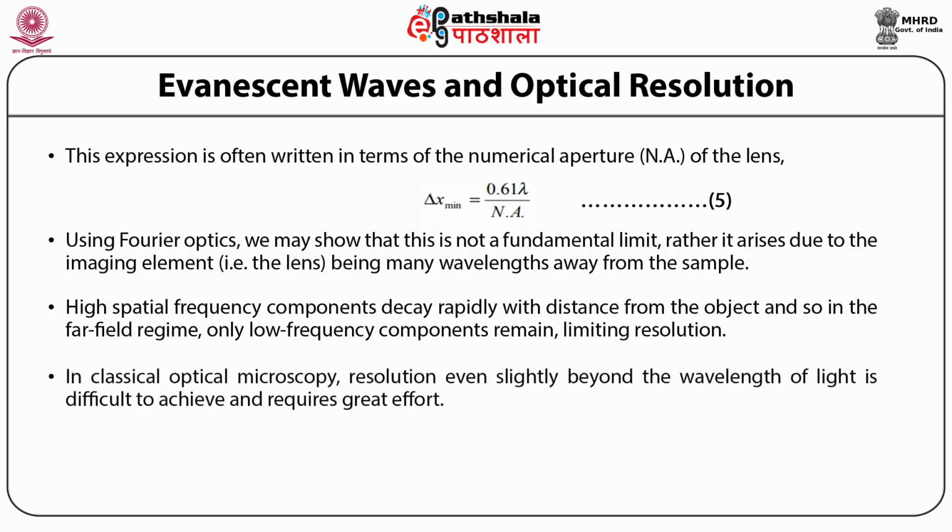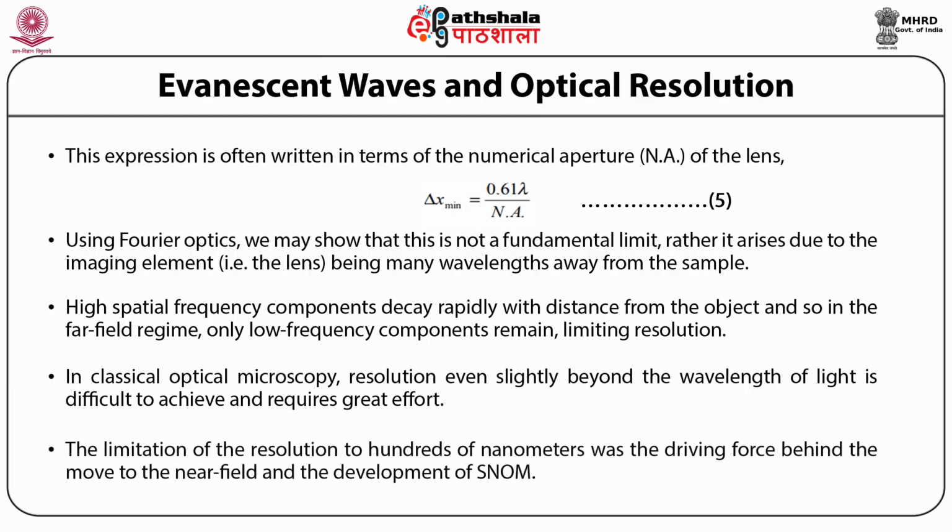In classical optical microscopy, resolution even slightly beyond the wavelength of light is difficult to achieve, and it requires great effort. The limitation of the resolution to hundreds of nanometers was the driving force behind the move to the near field and the development of SNOM.